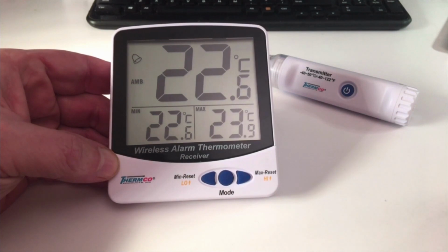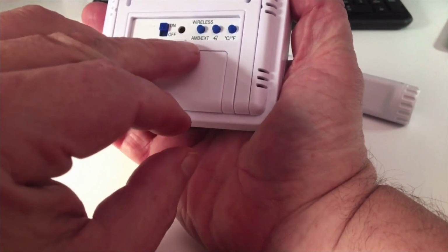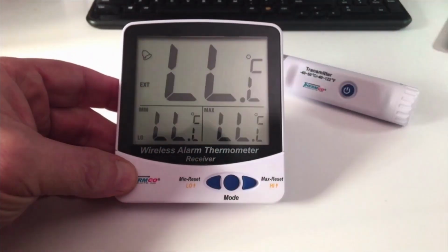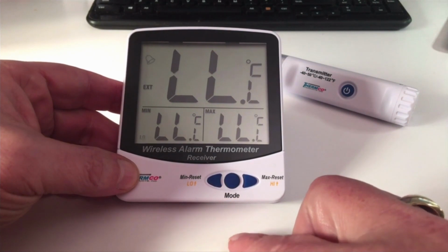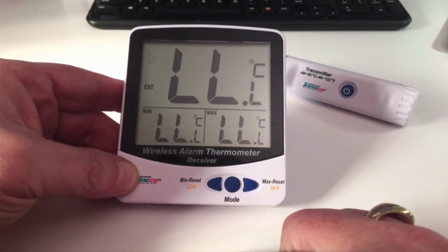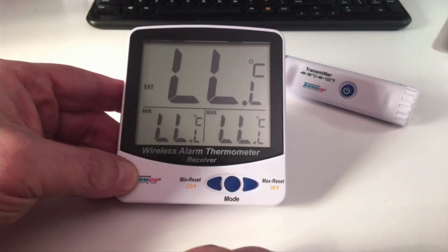But if you want to measure temperatures with a wired probe, turn the unit over and depress the wireless A and B EXT button. And now we're getting an alarm because we have no external sensor connected. To mute the audible alarm, press any button once. You also see now EXT on the display for the external wired probe.